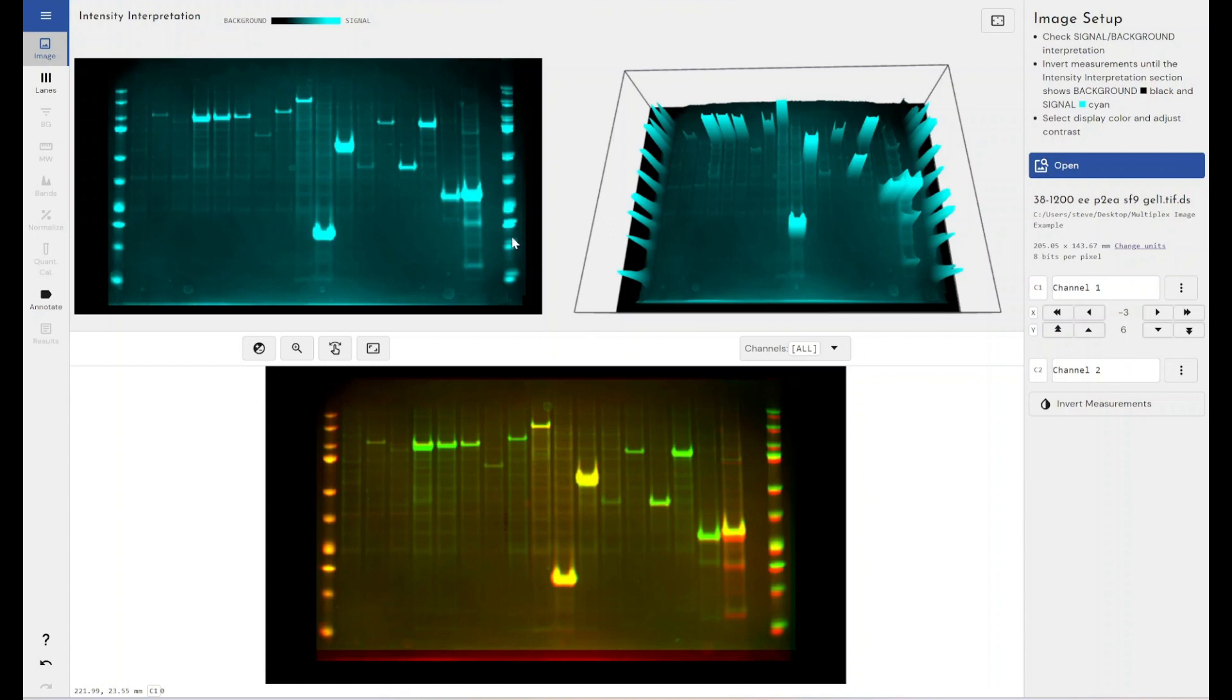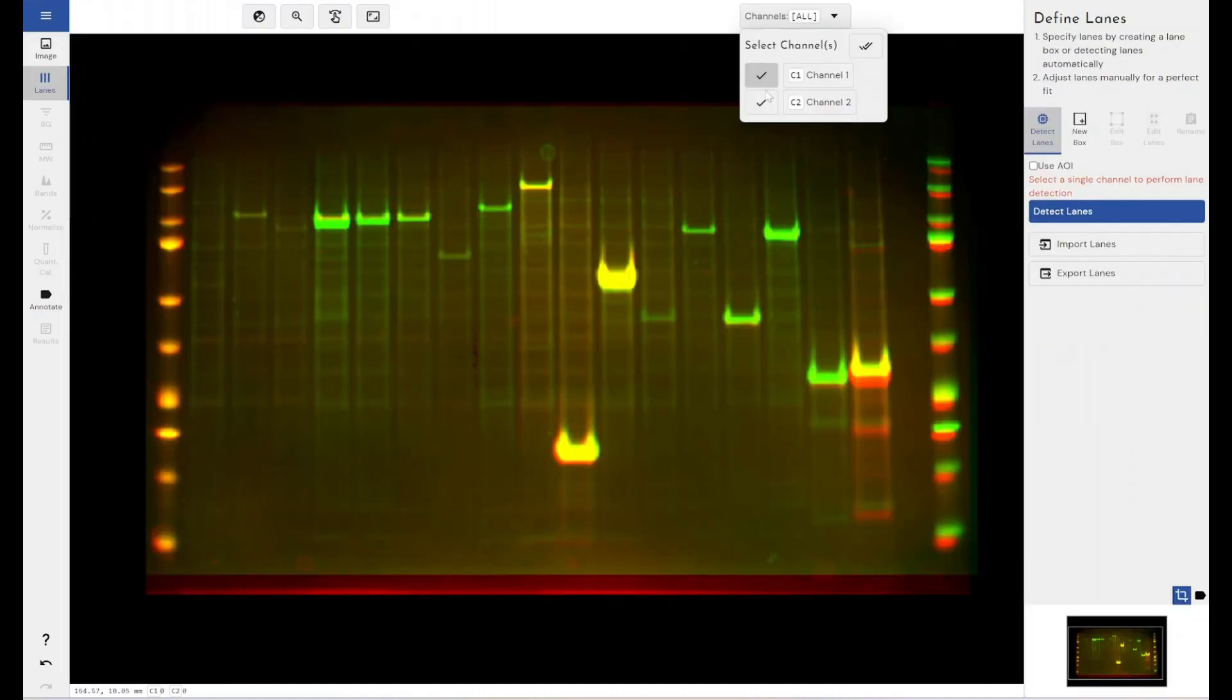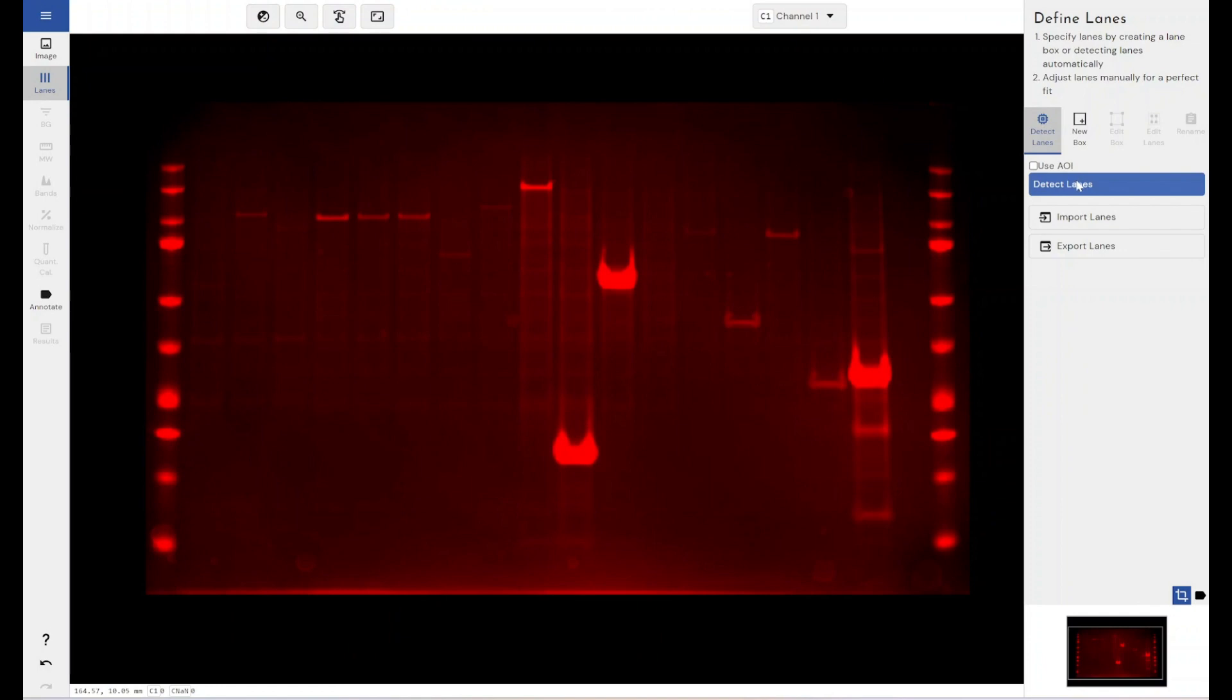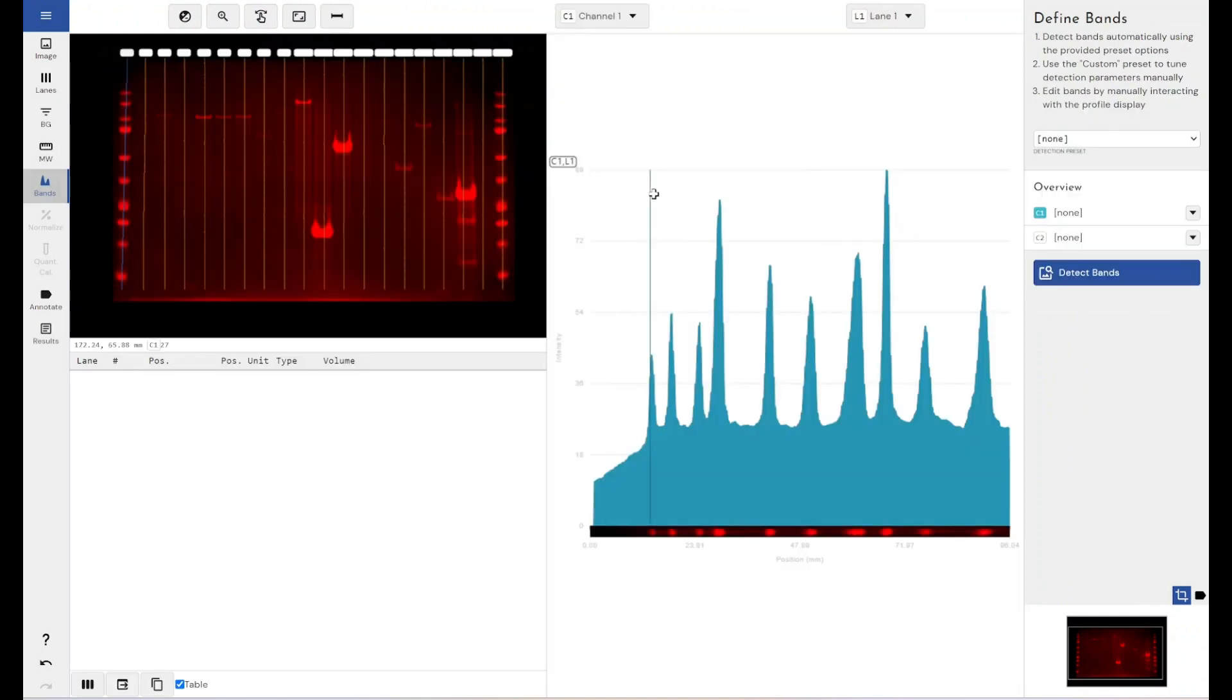So once I've done that and I'm happy with the alignment of my images, I can come across and perform my analysis as usual. So I'll just detect some lanes, which I can only do on a single channel at a time. I'll detect some bands.